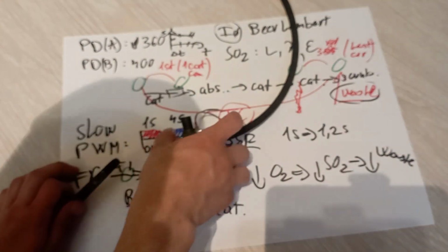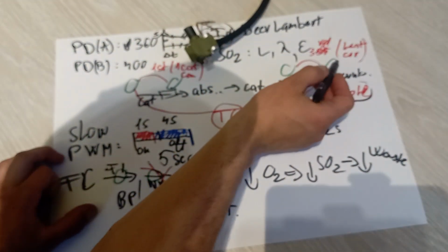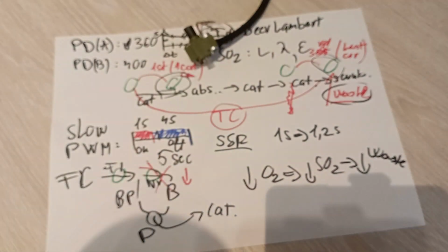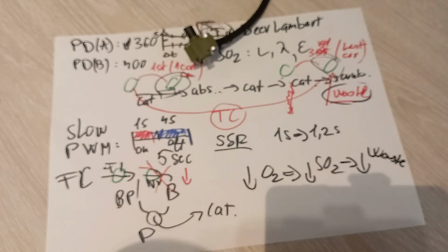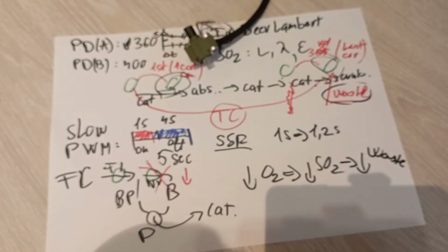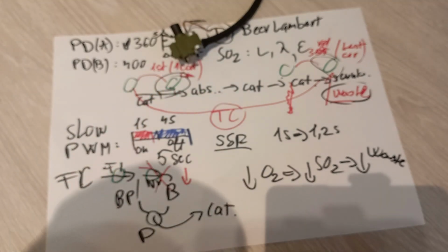So this is actually cooled. The before-catalyst GUVAs, the photosensors here and here, are not cooled. They don't have that little adapter there.